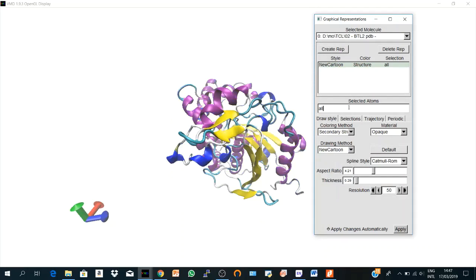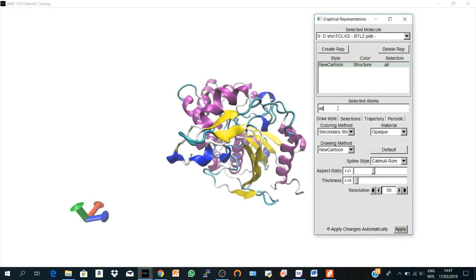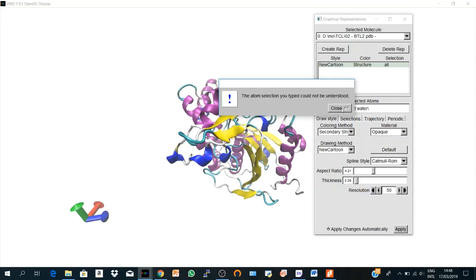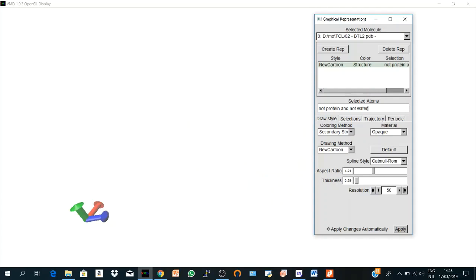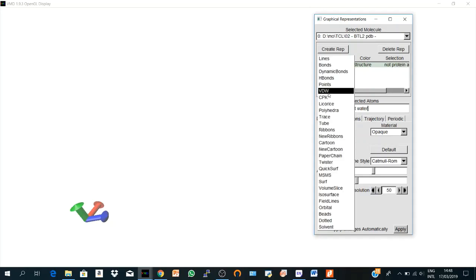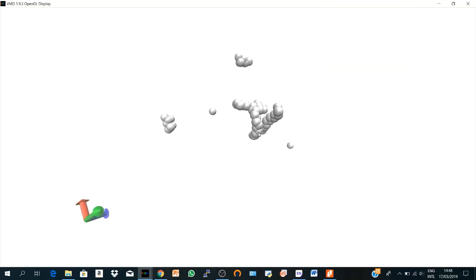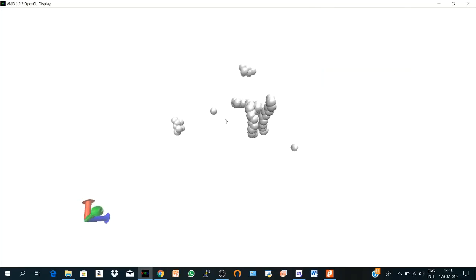And the selected atom text entry is very nice to work in. So let's create another representation other than 'all'. So if I set 'not protein and not water' and I hit enter, I don't see anything because what does it mean not protein and not water? In my structure it's only metal. So you cannot represent metal with New Cartoon. You will see nothing.